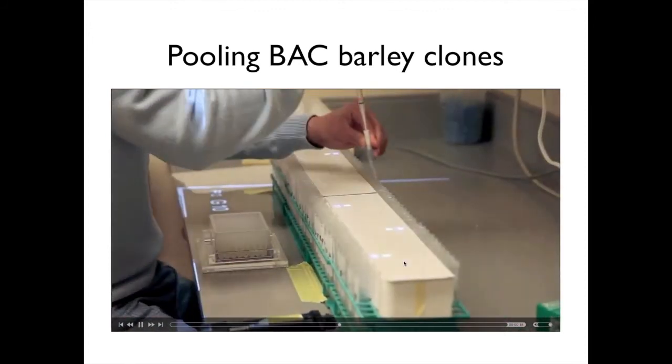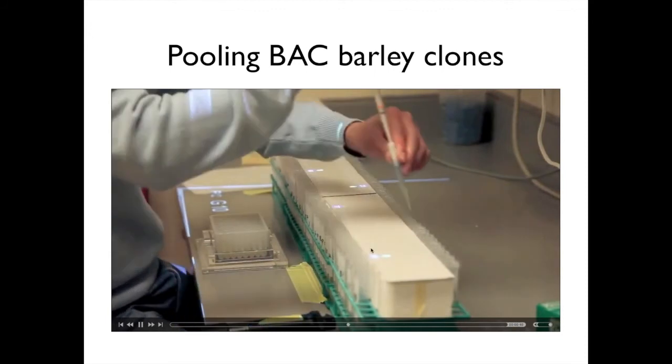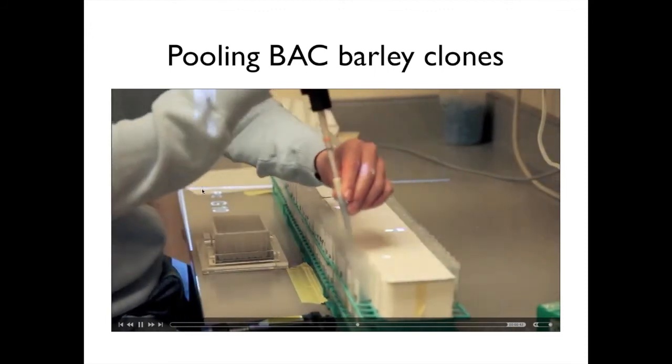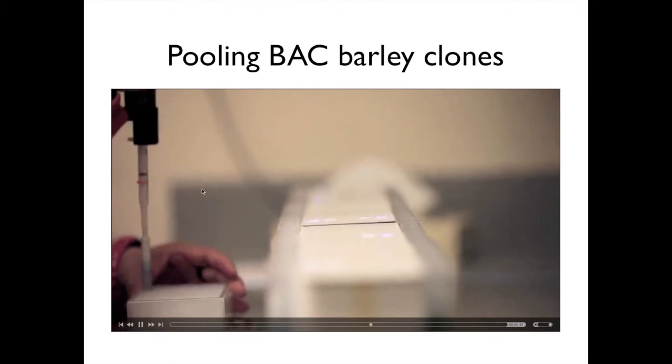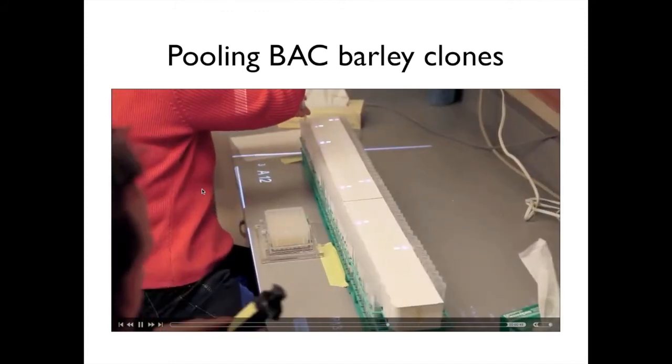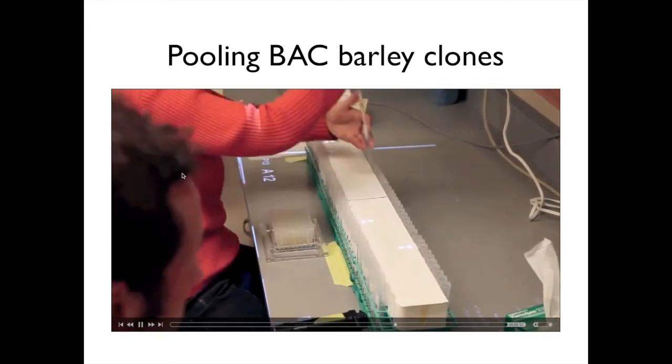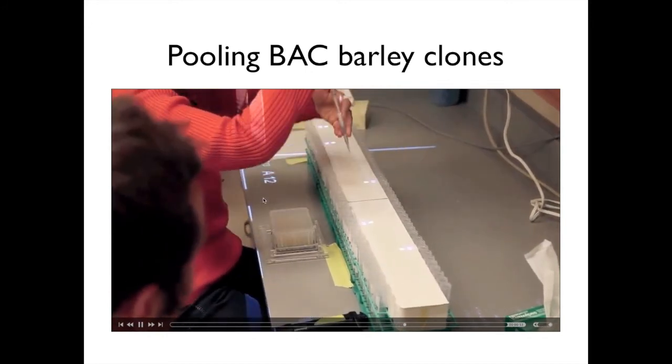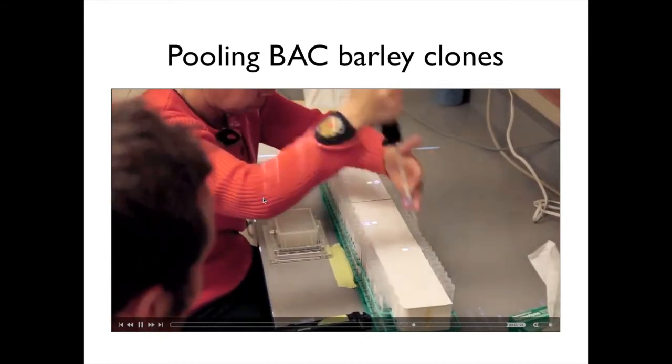So we go through one sample after another. You can see the light over here, G10. This is getting near the end of the plate. By now the mixer is over on another bench getting the next plate ready to set into position. So here's A12, the next pooler has come along and we're working through the next plate.